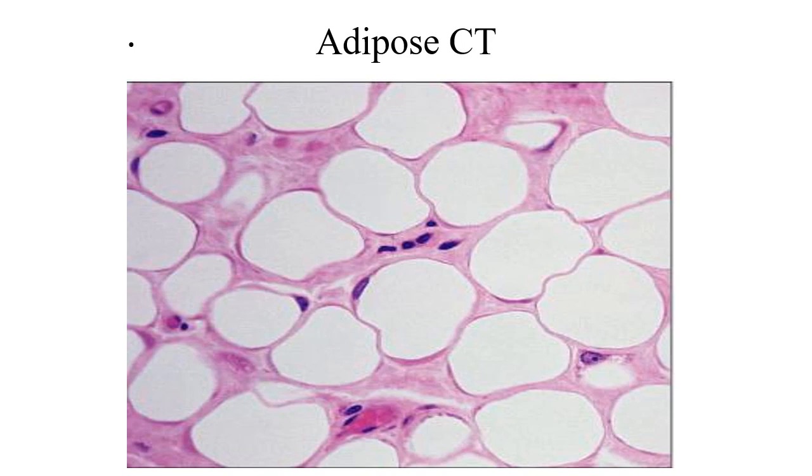Almost all of our connective tissues have visible fibers under the microscope, but there are a couple that don't. Adipose is one of them. Adipose, not only does it not have any visible fibers, but it's also one of those ones that really, once you look at it a few times, it becomes very evident as to what it is, because of these large vacuoles that each of the cells has. And so inside there are the lipids that those cells contain. Sometimes we see the nucleus of that cell, so that's the nucleus for this cell here. But depending upon how the slice was done, like these other ones over here, we may not actually see the nucleus for those individual cells just because of the way that it was cut. But it really looks like all of these big bubbles.